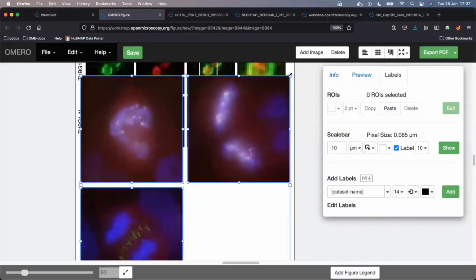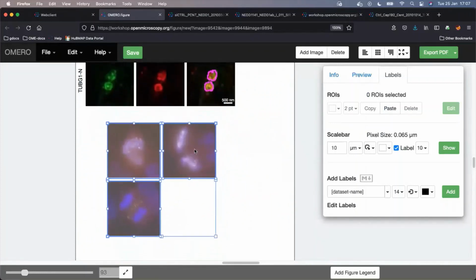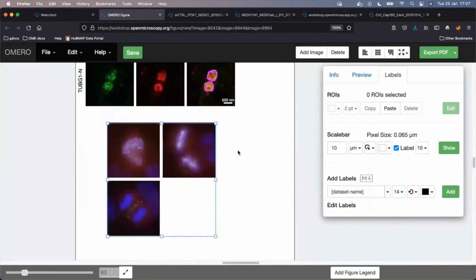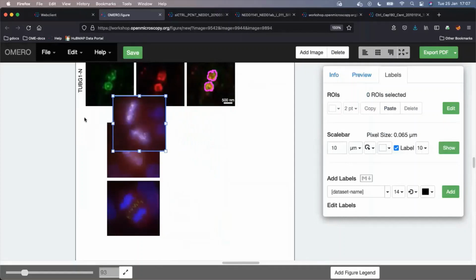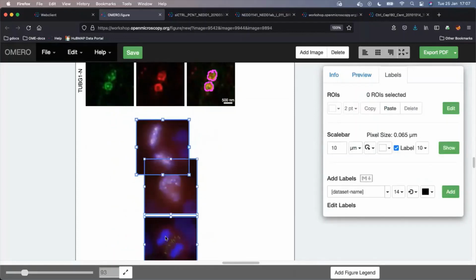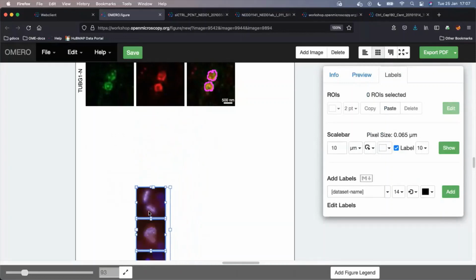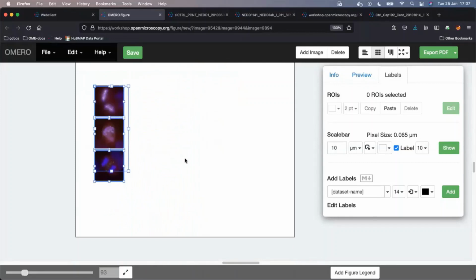And you can see that the three images, which are the confocal, the conventional microscopy, DV formats, have been added. I can now snap them to grid. They have to be a little bit more ready for that, like so. And again, put them into a column.